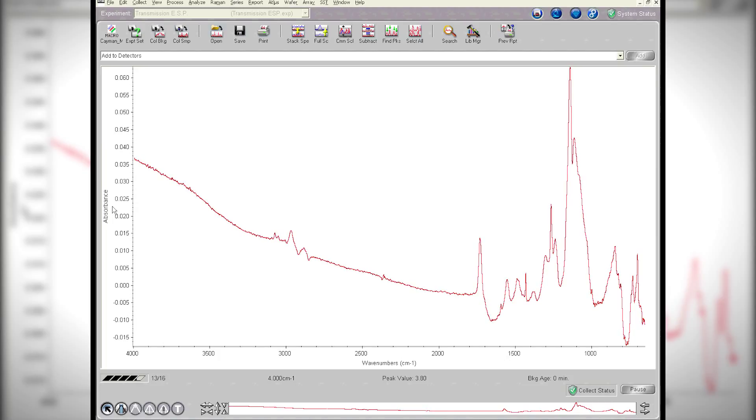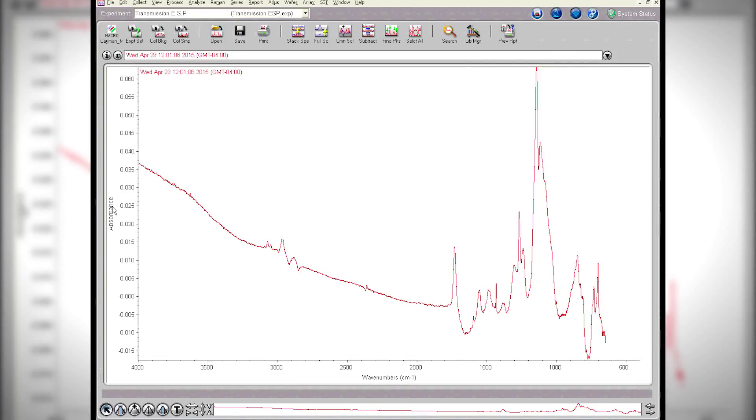We're only collecting 16 scans. A lot of times when you're looking at these very thin films, you'll collect like 256 scans or something like that in order to get the signal-to-noise good to see the very thin films. In this case, 16 is plenty good.